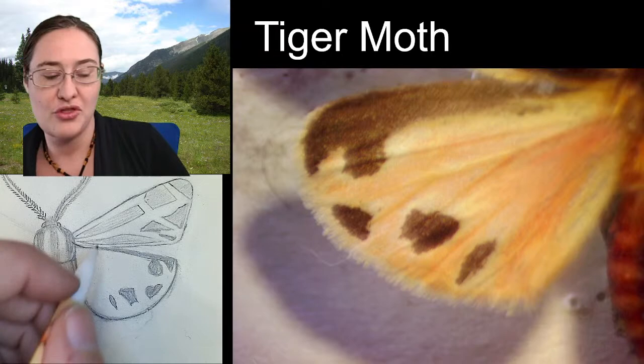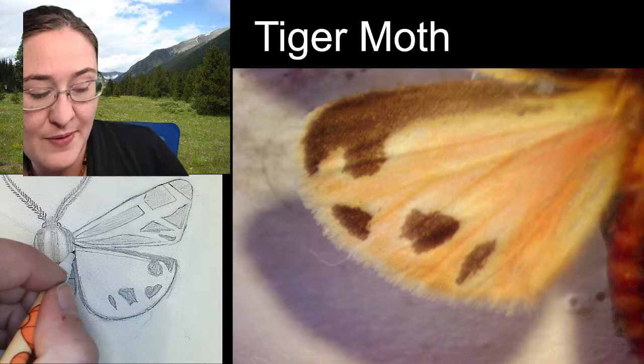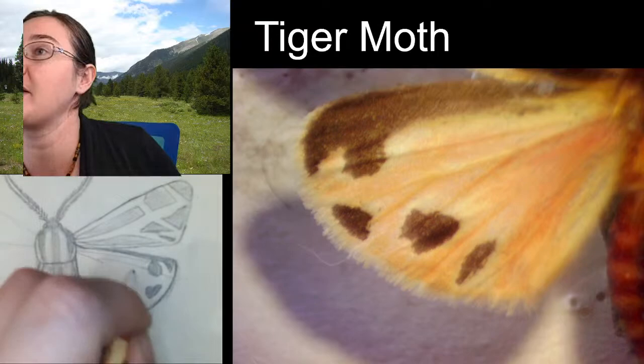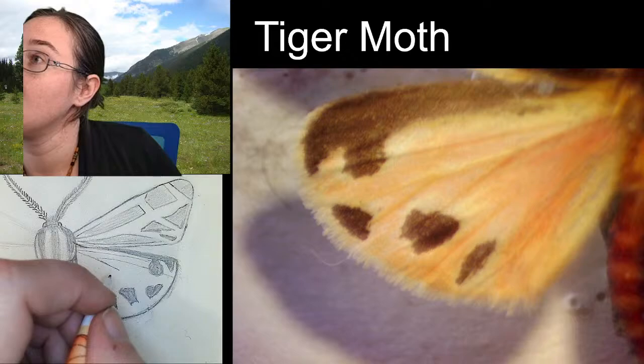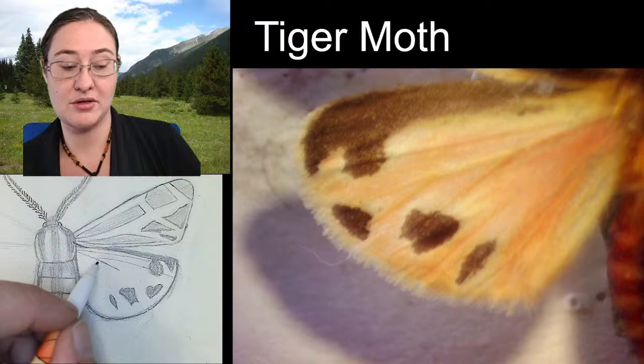There's going to be one vein that is up here in the darkness. Then we have this main vein that comes down, and it shoots one off up here that goes through that dark spot. All right, now we're going to come down just a little bit further. This is where that top one, this is where the first one broke off.